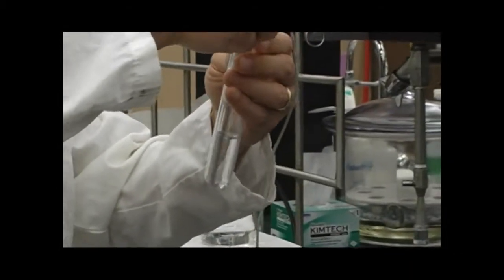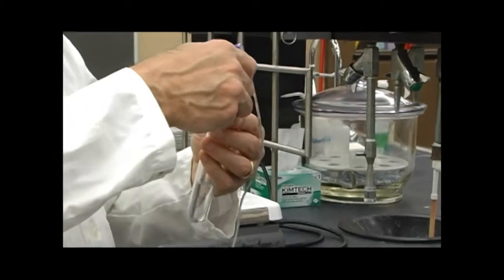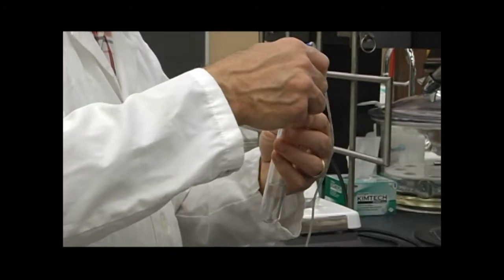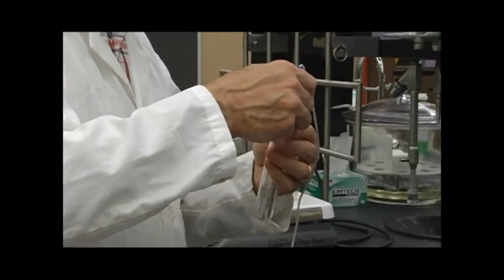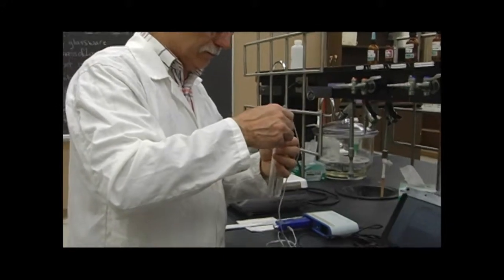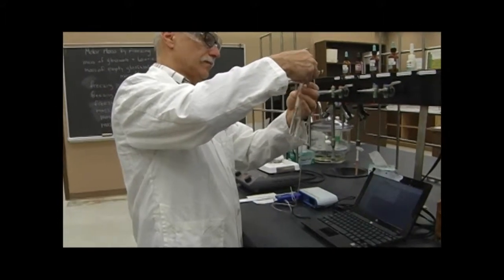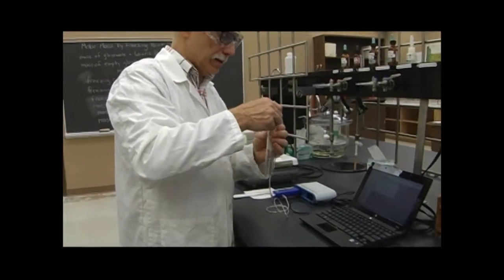We have no slush and we're at 43.5. Down to 42.8. No apparent slush yet.